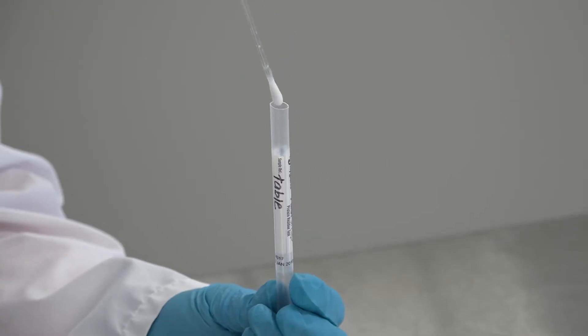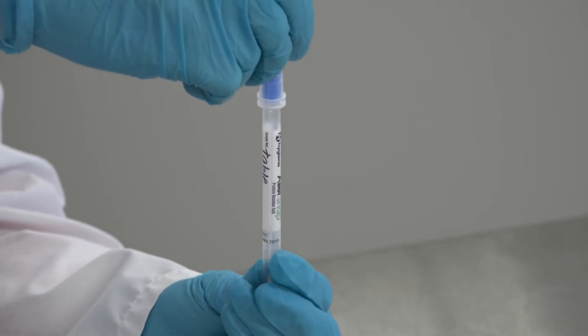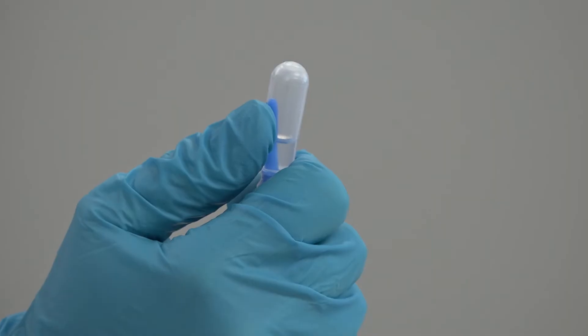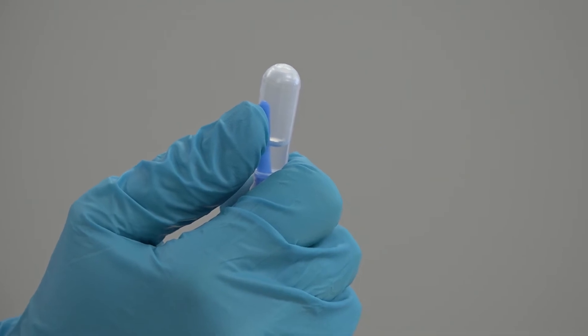Step number five, replace swab in tube. Step number six, to activate the test, snap the bulb by placing the swab in your fist.